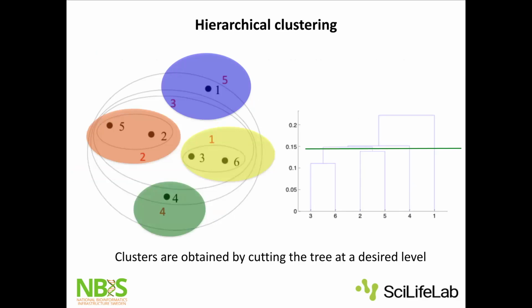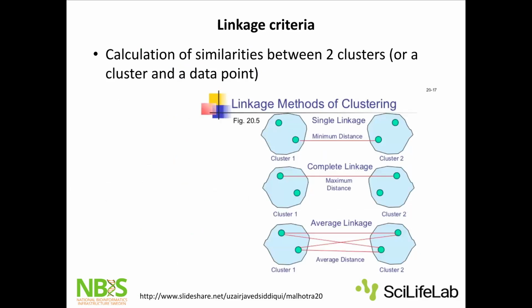It's simple, but you can make it quite complex because the biggest problem is how do we define distances, not between single samples. We start with defining pairwise distances between cells, but then when we start grouping them into clusters, we have to define distances between groups of samples. And the classical ways is single or complete linkage, just the closest 2 points in space, or the most distant, or the average of all points in 2 groups.